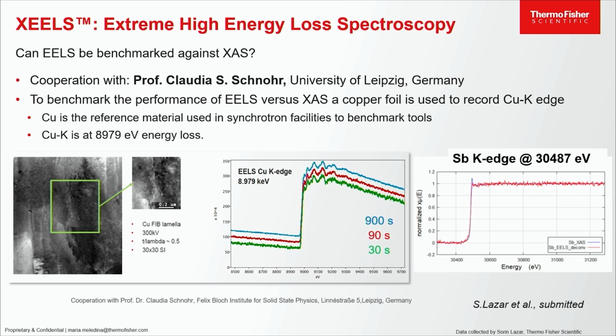So Sorin was presenting the stuff at conferences quite a lot this year, so I will not go deep into details, but in short, we teamed up with Claudia Schnorr. She's a professor at Leipzig University, and she is really a synchrotron person. It was a very cool, very fun collaboration. And she advised us a lot on how the synchrotron people act, what they do. And among the advice was the fact that they use copper like we use the cross-grating in microscopy. And that's why we did quite heavy testing with a copper sample, just to try benchmarking, and it actually performed very well. We could get the bond lengths out of it.